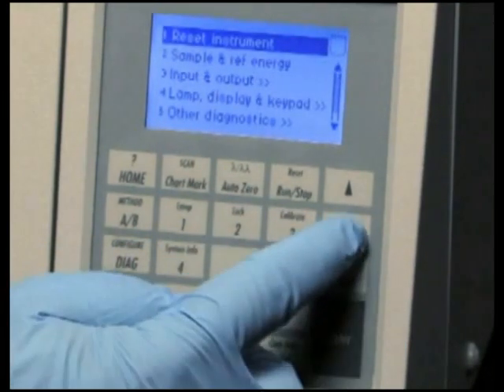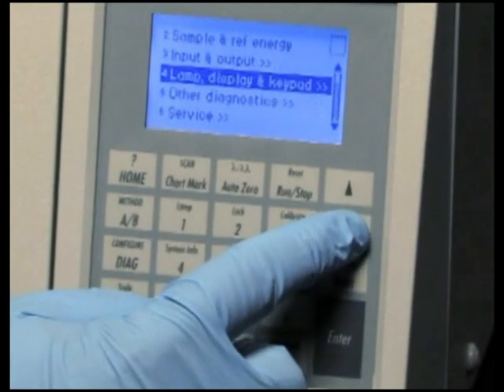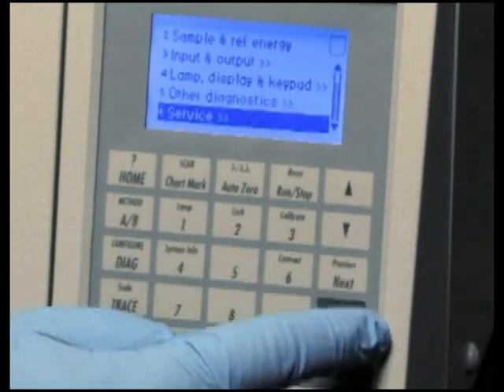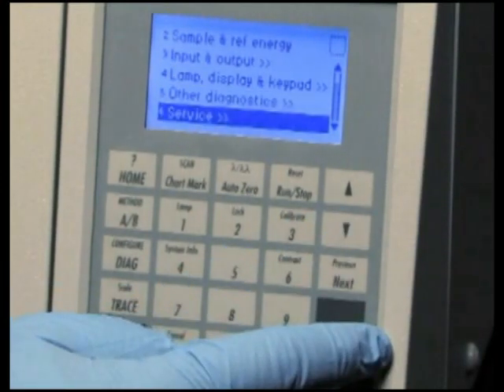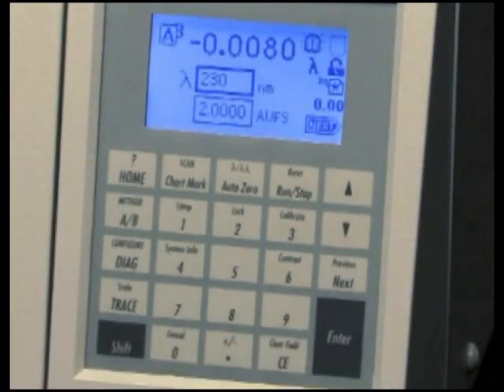Service diagnostics are only used by Waters Service Personnel. To exit Diagnostics, press the Home key.